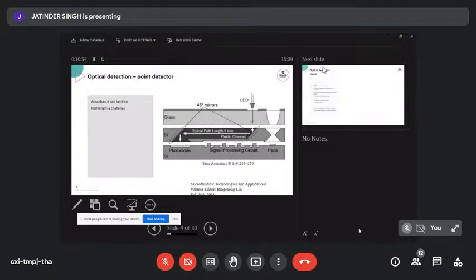So I'll talk you through a couple of examples on why things have been done. The first one here is absorption detection. It can be done, but absorption detection is stuck to Beer-Lambert's law, and one of the painful parameters in the Beer-Lambert law is that distance. Microfluidic small distances don't really work great.